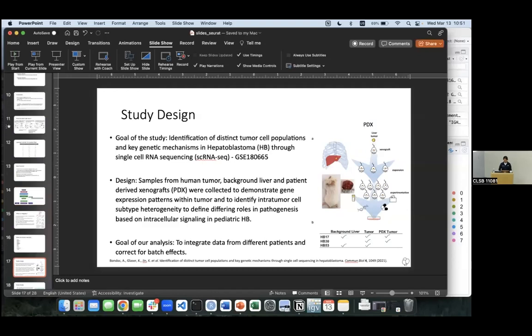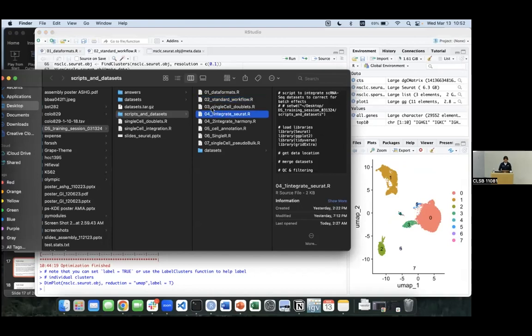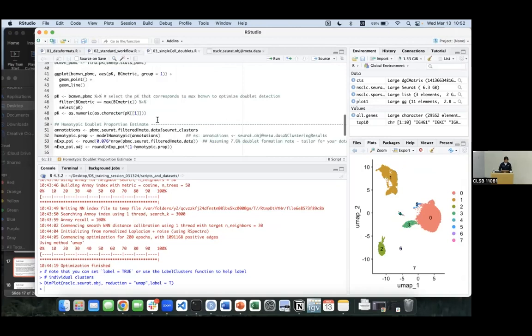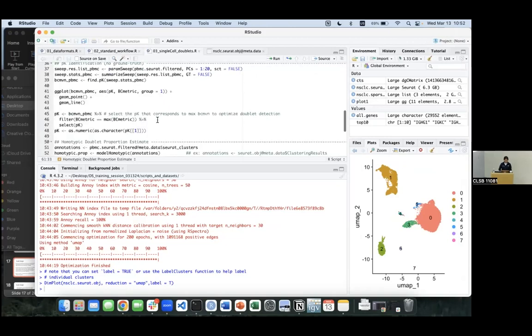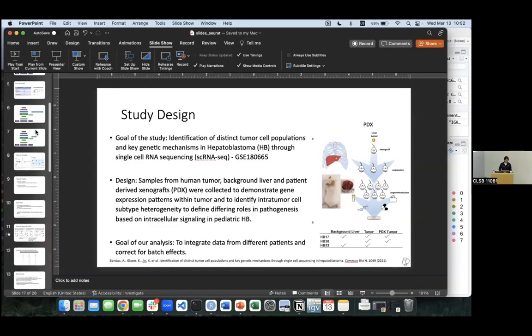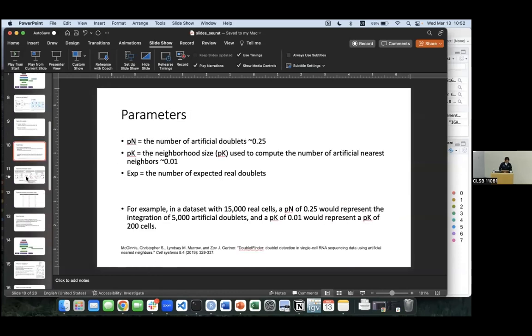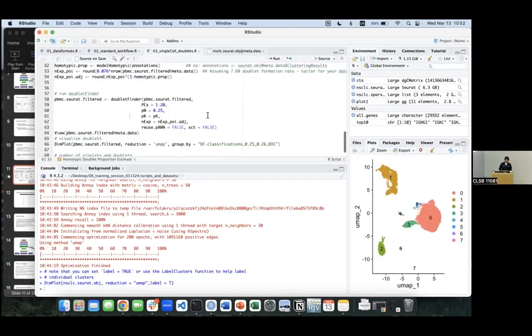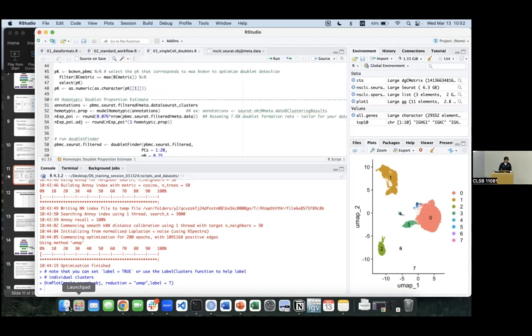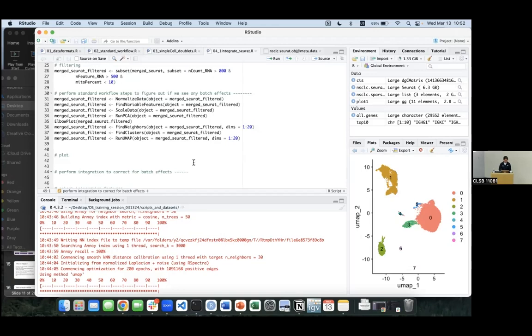So I skipped number 3, that is single cell doublet. I think it's already mostly in there and won't go into much detail of explaining what each step is, but essentially, if you follow the parameters and the steps, it's all up here, and I kind of provided some comments. I'll add more comments afterwards. So right now, let's open the integrate Seurat file.